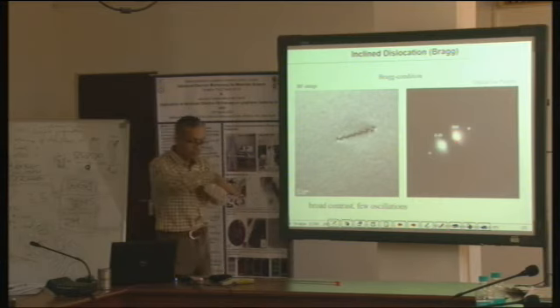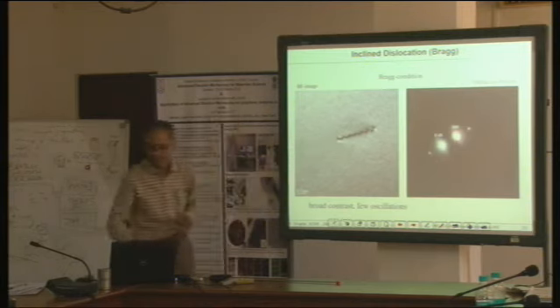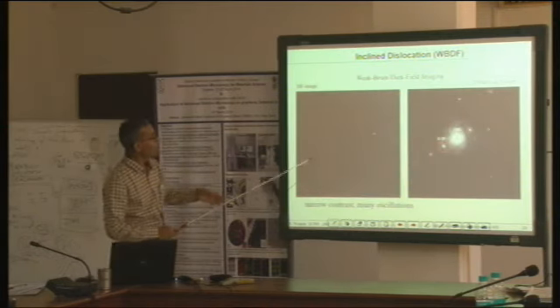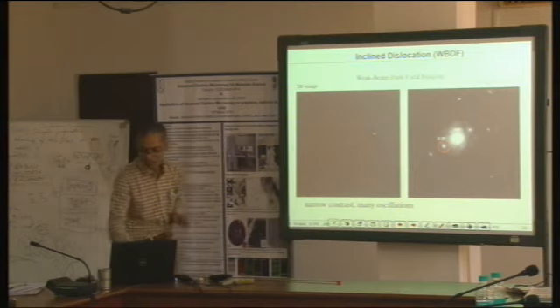So as the thickness changes, there is some dynamical effect because of which we see this fringe pattern or oscillating contrast, etc. And if you make a dark field image, or weak beam dark field image, the same thing looks like this. So the periodicity of the oscillation increases, but it becomes thinner and so on.